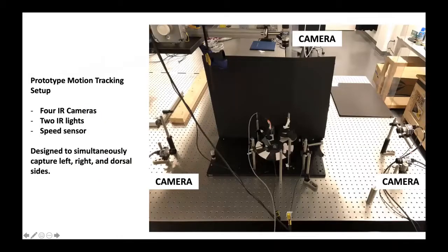All right. So one of the main aims of this project is to understand how the central pattern generating circuits in the spinal cord coordinate locomotion. So what we'll need to do is film the movement of the hind legs and the activity, and then in the end, we get a few different data streams.